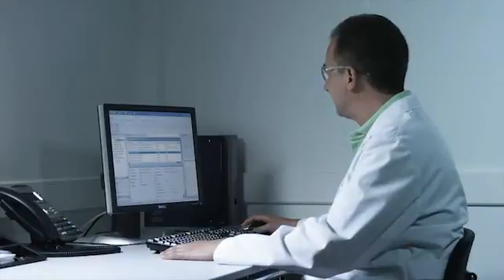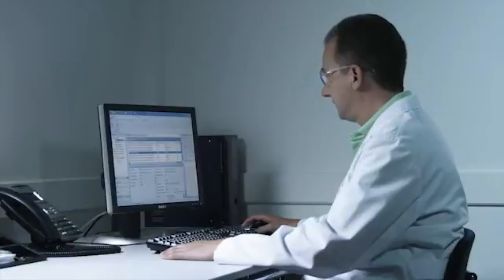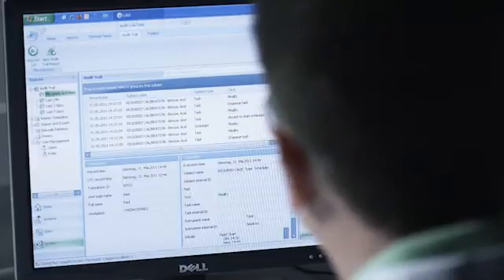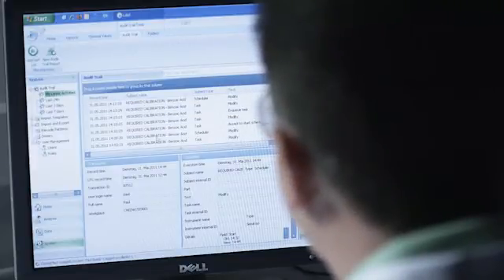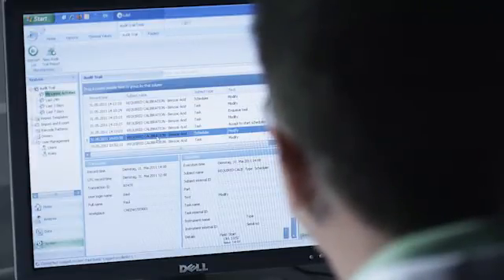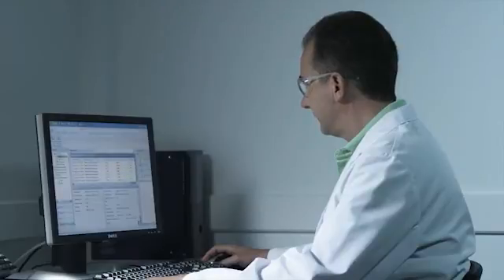At the end of his shift, Paul checks the measuring reports in the audit trail. He wants to confirm to his manager that everything is ready for the next audit. Thanks to LabX software, all reports are securely documented on the system and fully traceable.